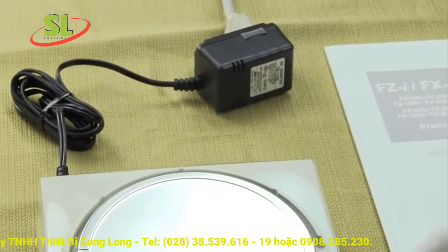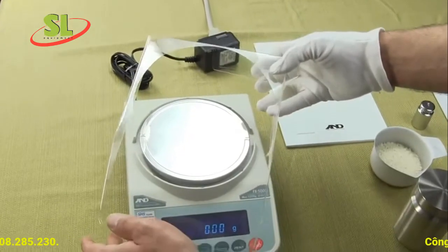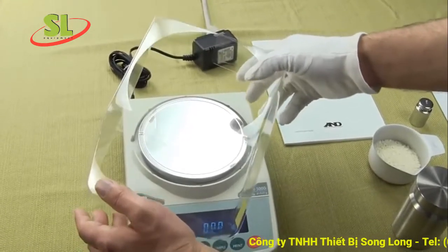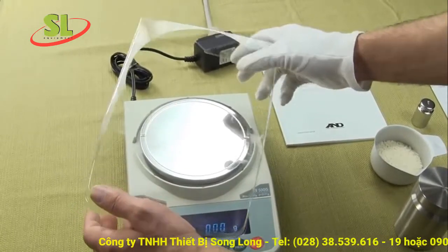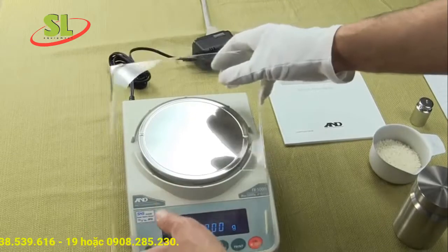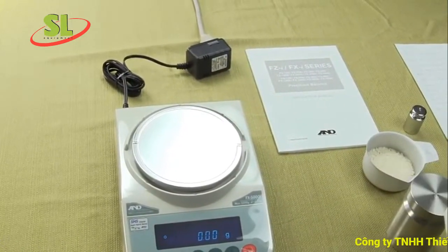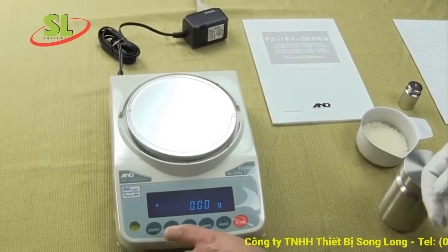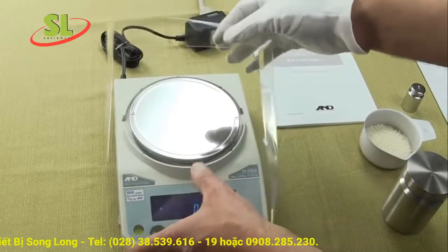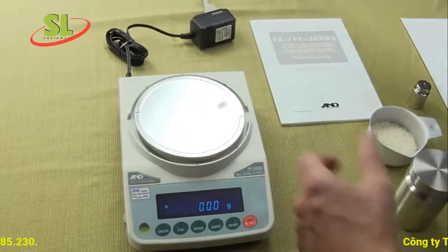The balance also comes with a spill guard. A lot of manufacturers on the market today charge upwards of $45 to $50 for this — we have one manufacturer charging $50. It's a low-cost plastic shield so that if, say, your hands were covered with ink, this protects the keypads and the scale. It's a basic but useful feature, and it comes standard with the unit.